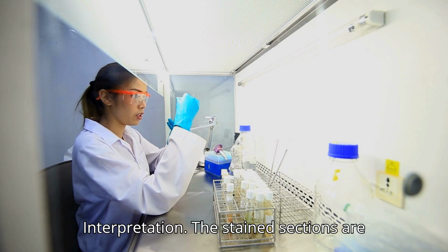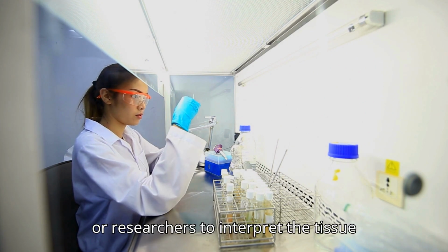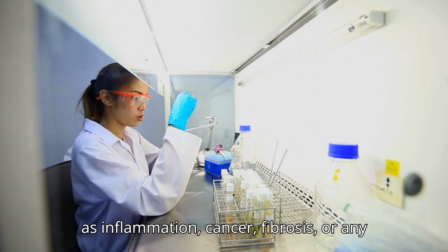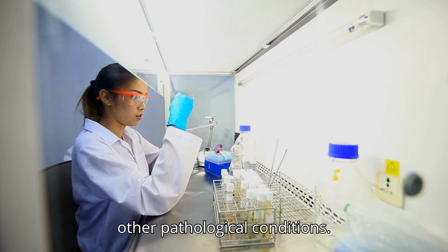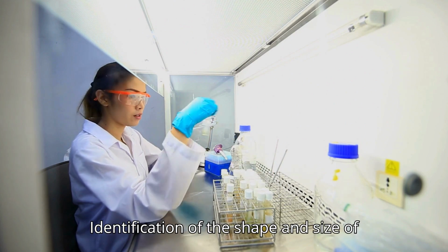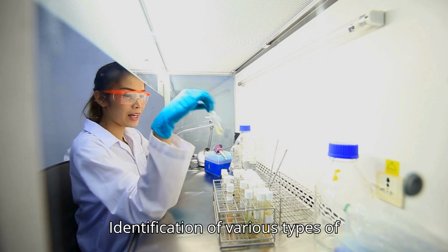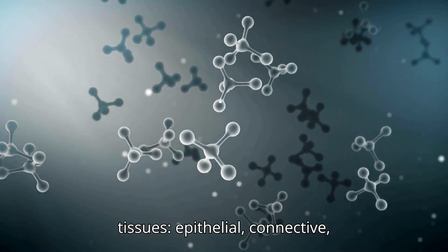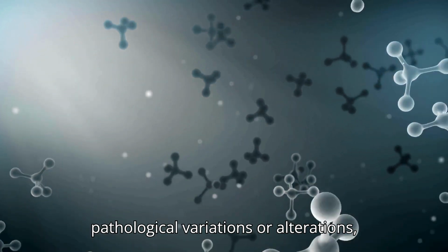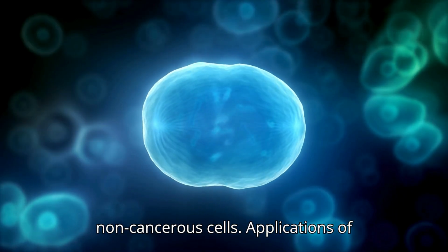7. Interpretation. The stained sections are examined by histologists, pathologists, or researchers to interpret the tissue structure and identify abnormalities such as inflammation, cancer, fibrosis, or any other pathological conditions. Examples of analysis: identification of the shape and size of cells and how they are arranged. Identification of various types of tissues: epithelial, connective, muscular, and nervous. Pathological variations or alterations, i.e., distinguishing cancerous from non-cancerous cells.